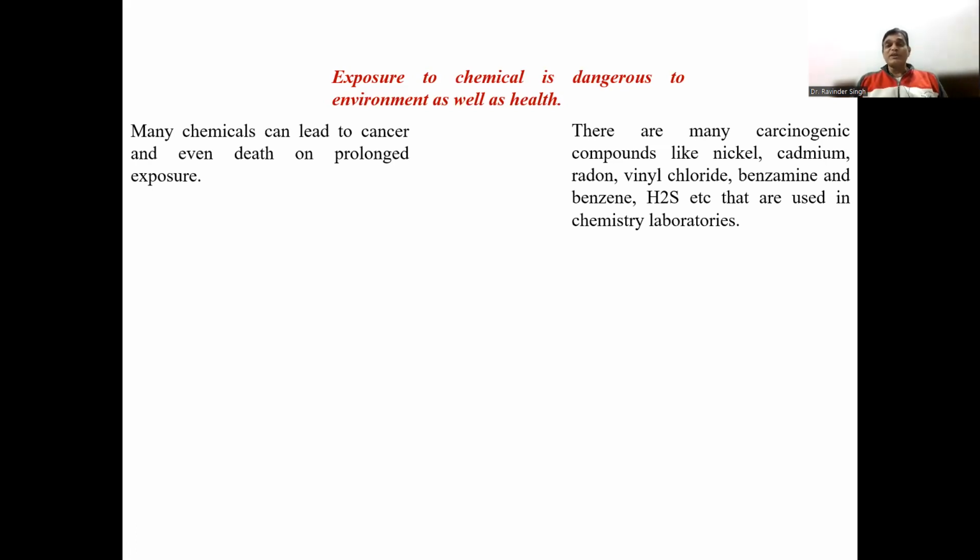So always use these chemicals with all the instructions which are laid down by the chemical industries, by the higher authorities, by the government, and by the chemistry faculty teachers before the experimentation process, and which are also laid down from time to time by all the laboratory attendants who have been working in these chemical laboratories for a very long time.